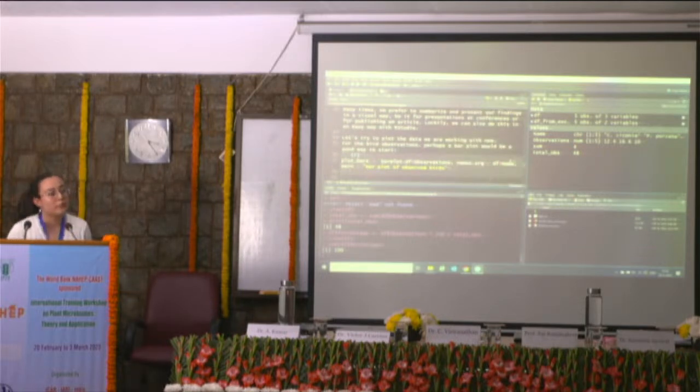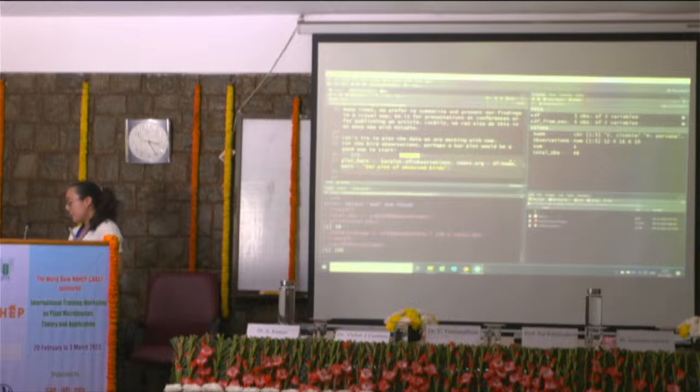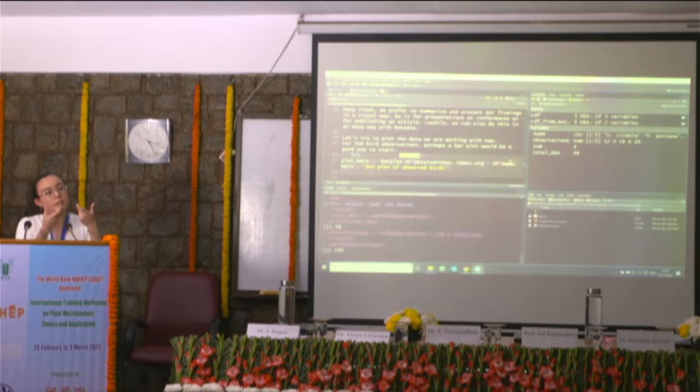I want to do a bar plot right now with all the observations that we have. So the bar plot would have the observations in the bars, and then in the x-axis, each species name, right? So we can do that. There is a function that is called bar plot. See, this is what I tell you. The names of the functions are very descriptive. It's very nice. So for bar plot, for functions like this, there is an order.